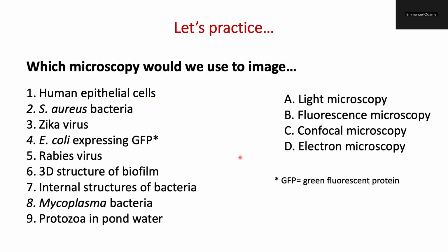So now let's practice. Which microscope will we use to image a human epithelial cell?